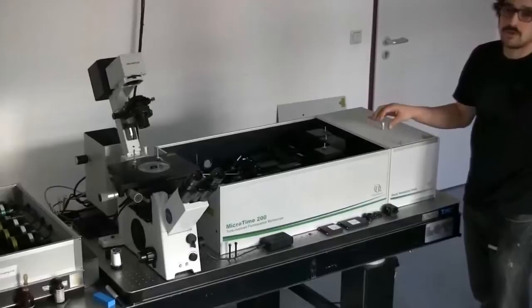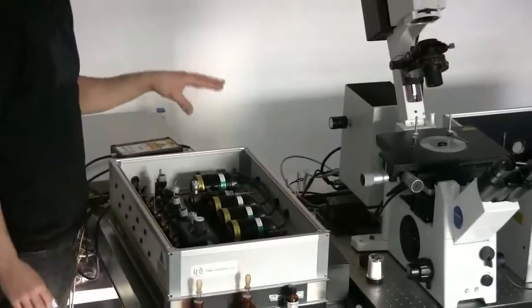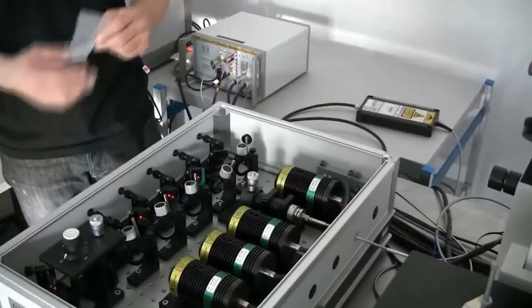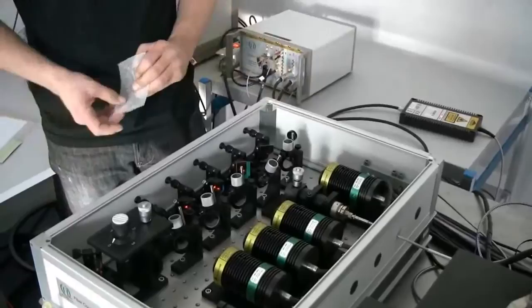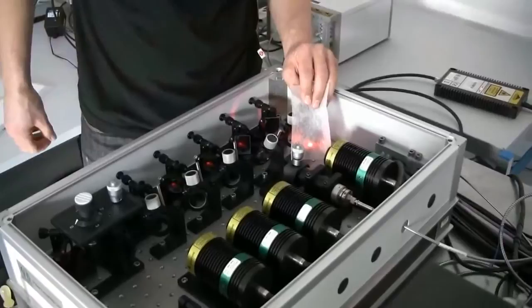You can see this system is quite modular and can be extended with other detection options as well. So we first go here to the laser box. In this box we have four diode lasers and one fiber coupled green laser. The reason for using a dedicated box for the excitation and feeding all the lasers into a single mode polarization maintaining fiber is connected with the beam profile of the lasers, and this is especially true for semiconductor lasers that have a beam profile that looks a little bit elliptic — you can see these kinds of not-so-nice beam shapes.